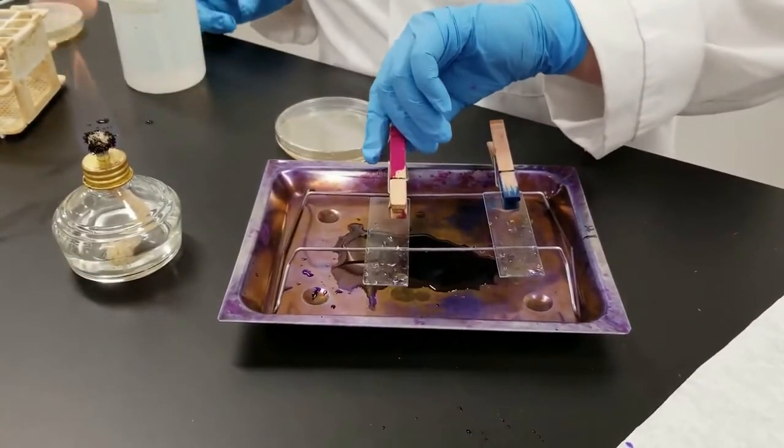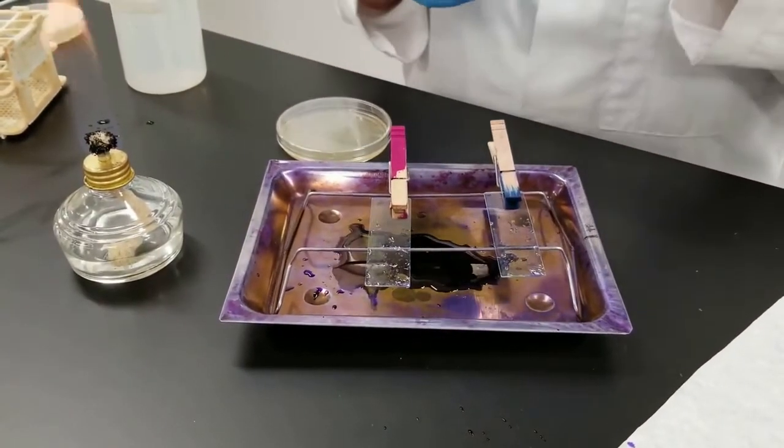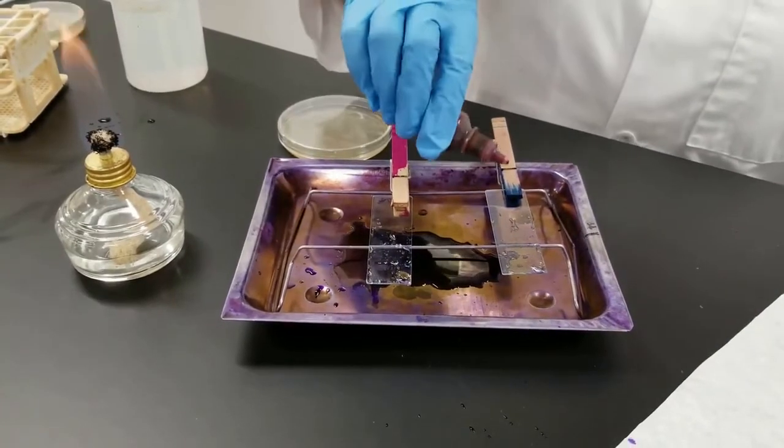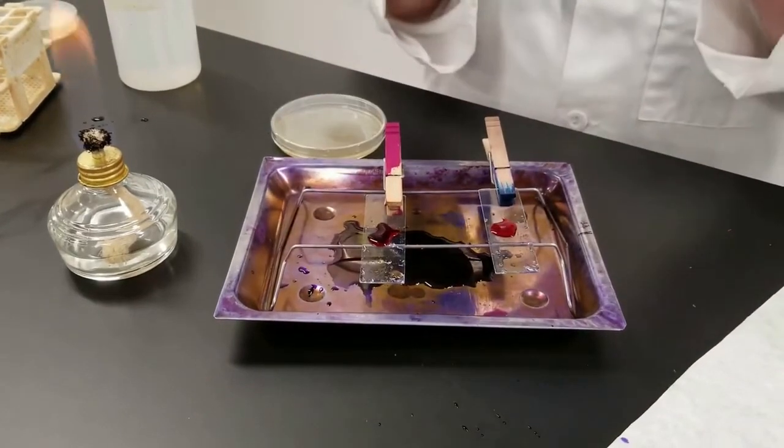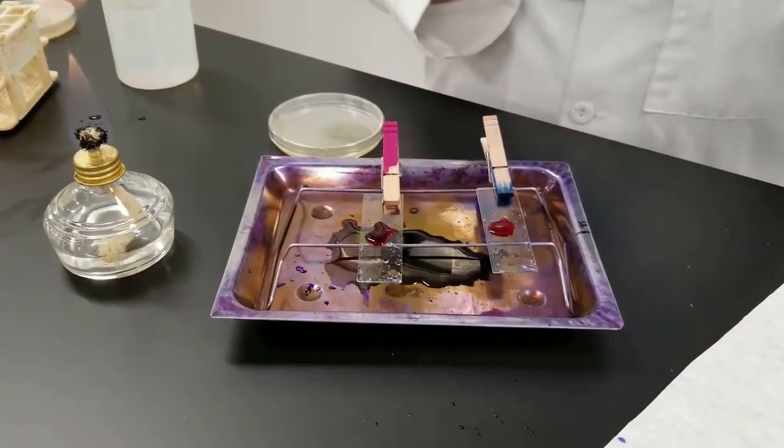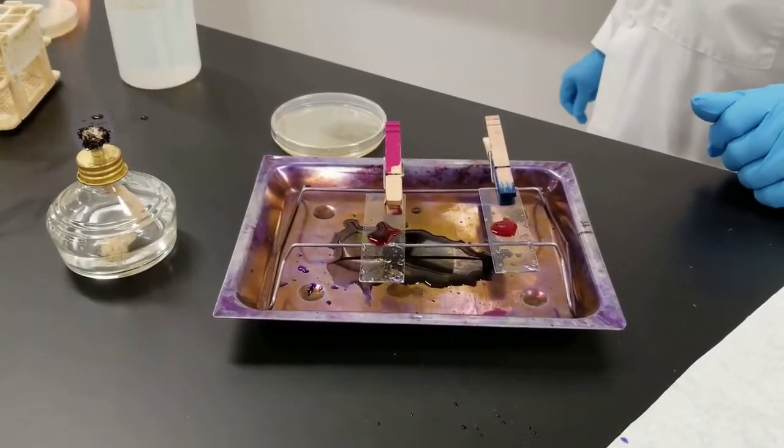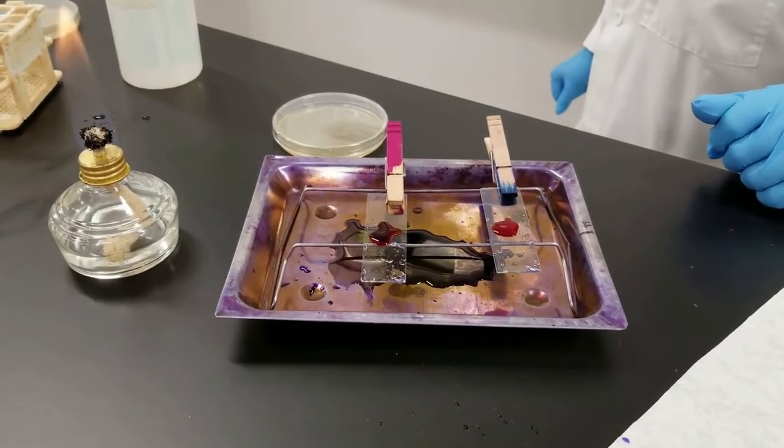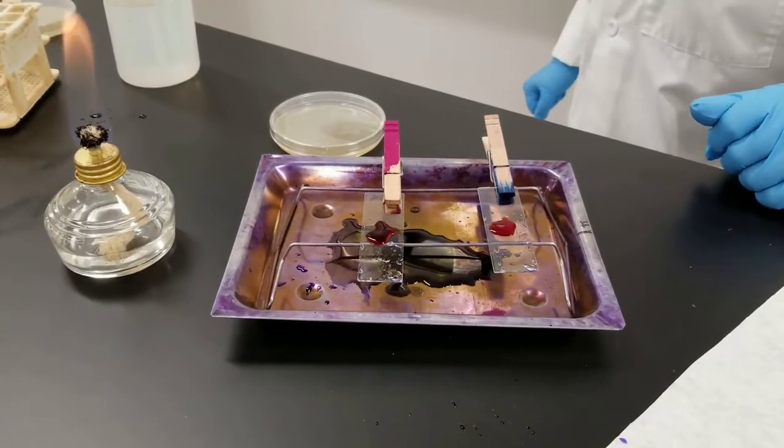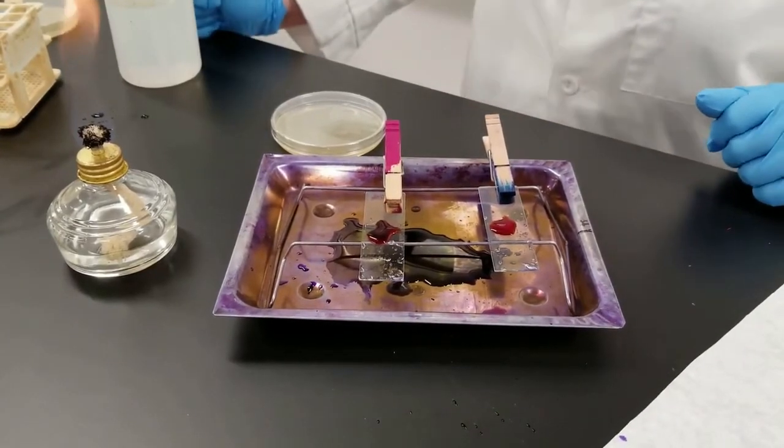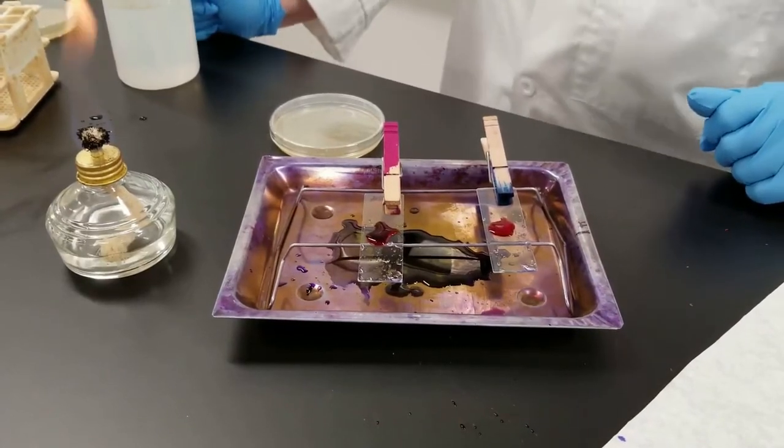At this point, your gram-negatives would be colorless, the gram-positives would retain that purple or blue color. The last step is we are adding safranin red. This is a counter stain or a secondary stain. Your gram-positive should remain purple and the gram-negatives will pick up that red stain. We leave that on for a minute. So your timing is crystal violet one minute, iodine one minute, alcohol 30 seconds, safranin red one minute.